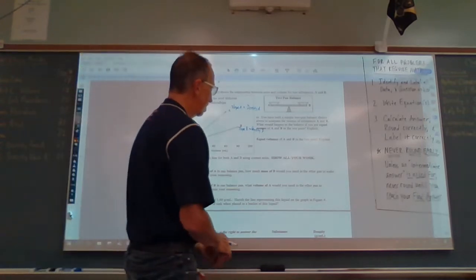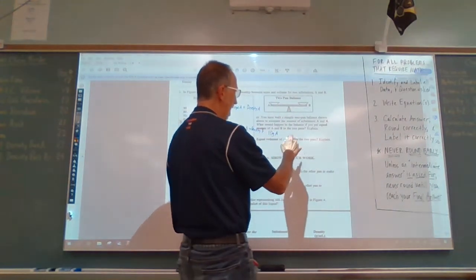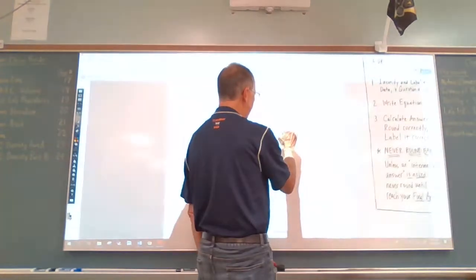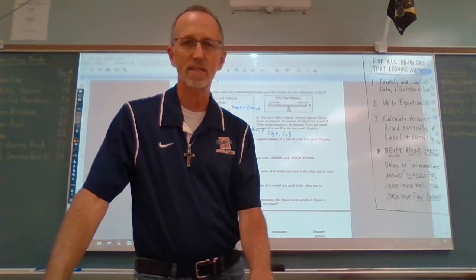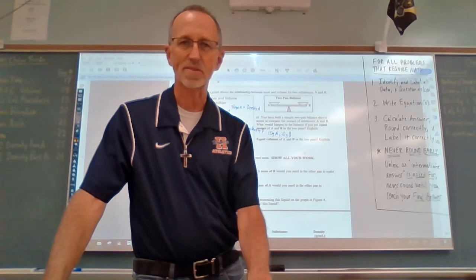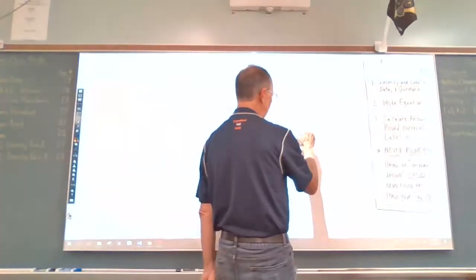Well, for instance, if you put 10 grams of A on the A side and 10 grams of B on the B side, equal masses, what would happen? Well, what does a balance measure? It measures mass. If the masses are the same on either side, then the balance is going to remain level, all right?